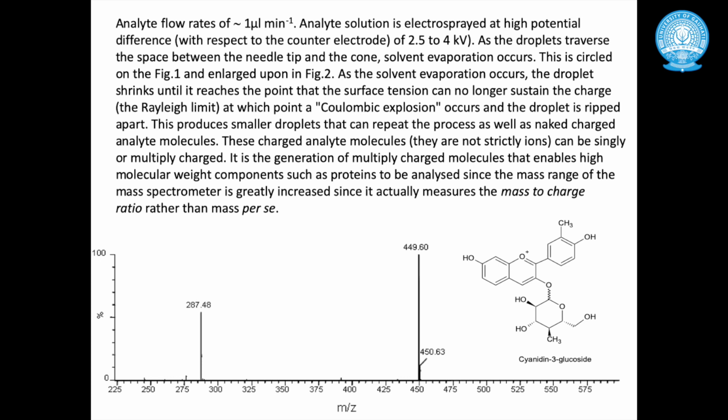So the mass, the spectrophotometric profile and its prior studies by using biomolecular spectroscopy, when we combine all this, when we collect all these data, we will be able to identify the compound.